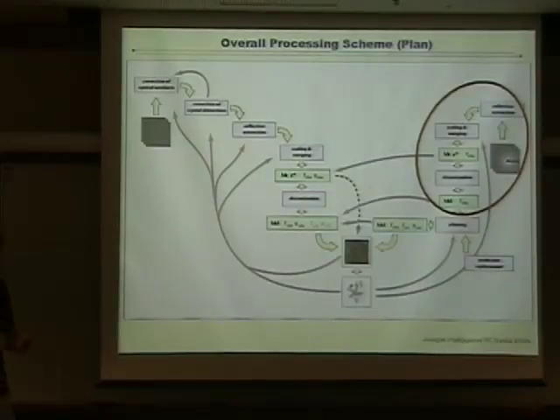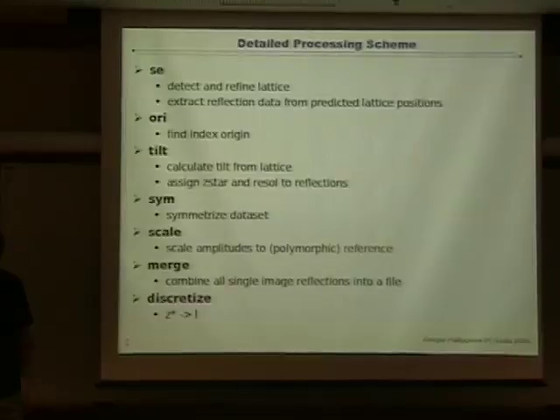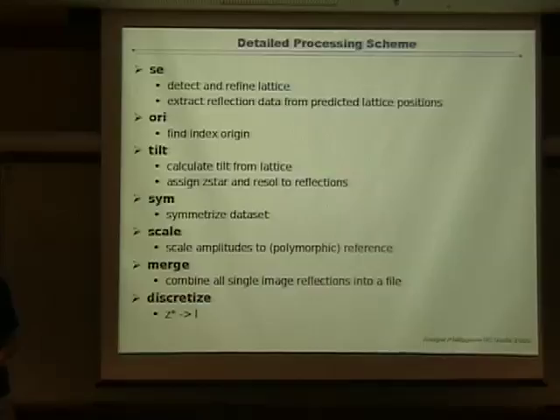Now, if you have a faint recollection of my previous talk, I had this schema with image processing and diffraction processing, and now, since we are focusing in the EU on this, we are also focusing on this, and this is the most mature part, so I just want to spend a few words now on this. Notice that the circle does not extend around phasing. Now, this detailed processing scheme is, I think, similar and different to what we heard how MRC does it.